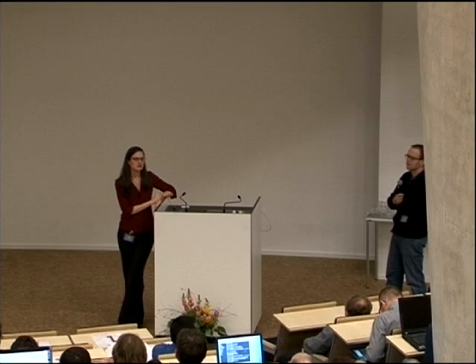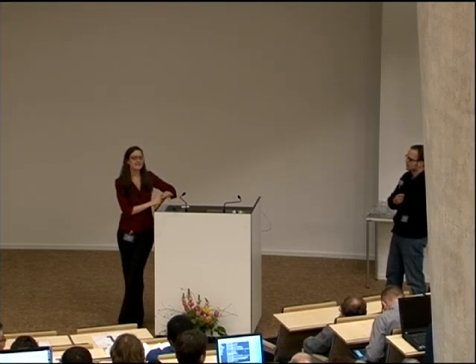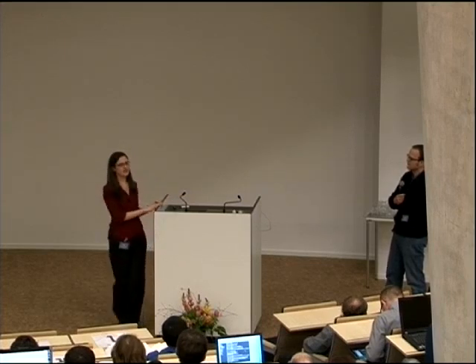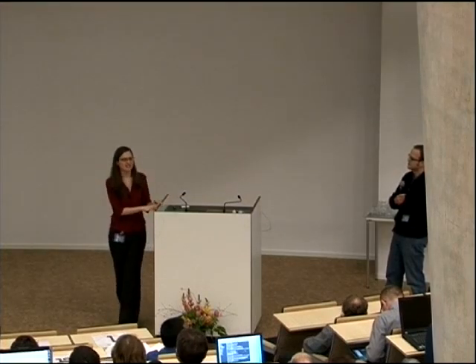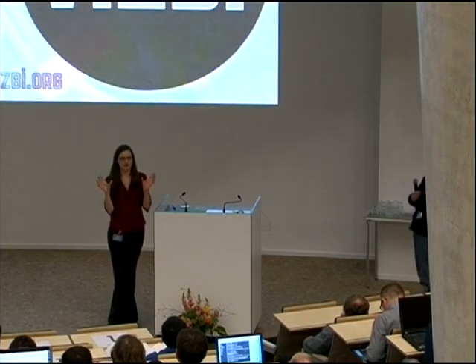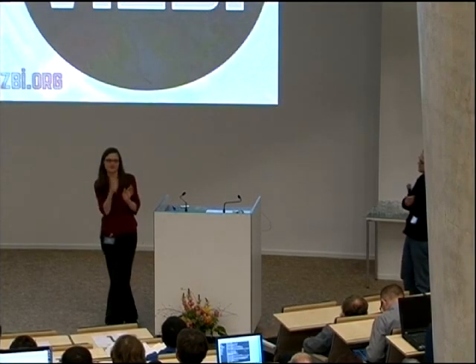Is that a large number or a small number? The discrepancies. Right? Oh, it's a pretty large number. It depends on your phenotype. Usually a phenotype is defined in the biologist's mind as yes or no, but any two biologists have the threshold slightly wherever it's going to be, and the computer would be the same way.